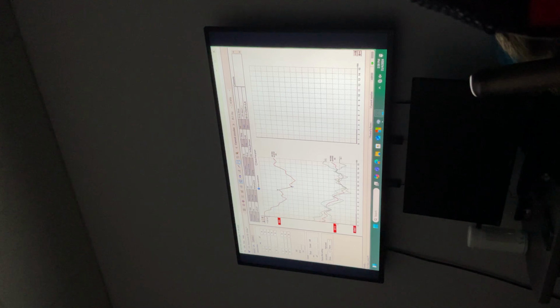What's going on at 10? Where is our prospect? Anything to call a response? Right. Something better now, between 8 and 9. Yeah, here, this one. So A is, what is that? B is condensation.